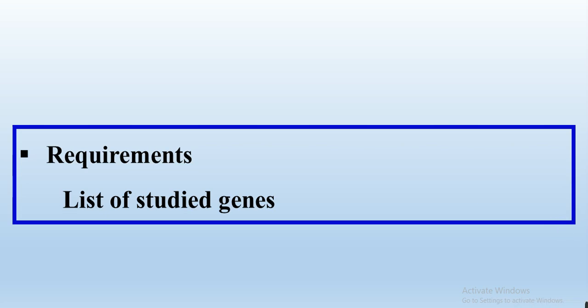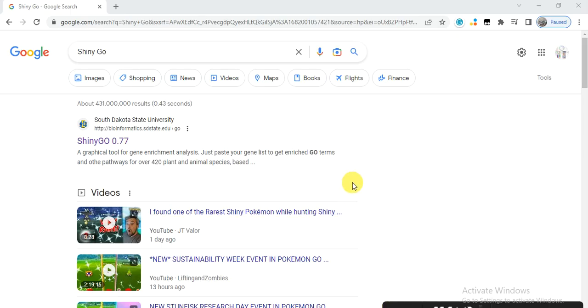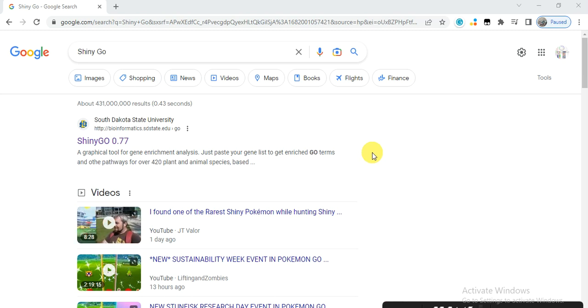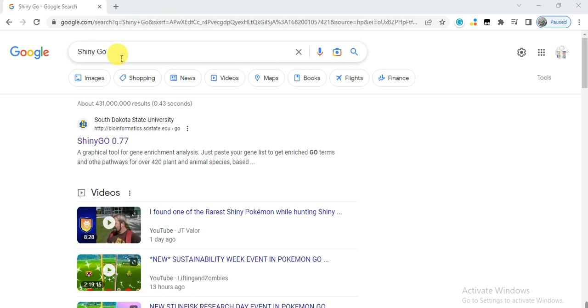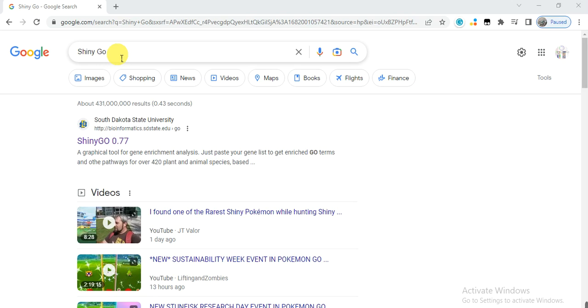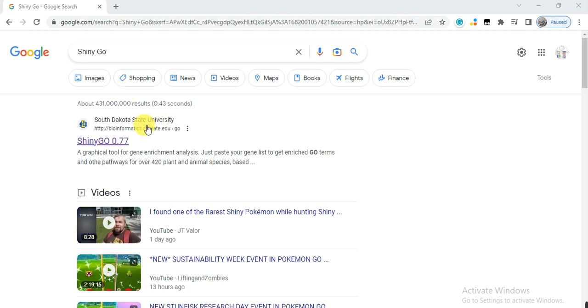How to do this? Let's start. Go to Google or any search engine, and in the search bar write ShinyGO. It is the name of that online tool.